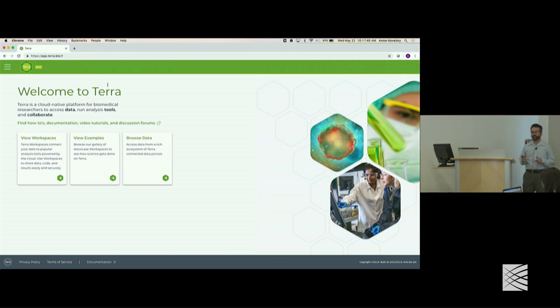The reason we're going to start the notebook before the break and then come back and use it after the break is because the spinning up of a notebook cluster is the one thing that may take a little bit of time. So once the notebook cluster is running, then you just click, and as soon as you click run, that cell will run as quickly as it can on whatever computational resources you've allocated for it.